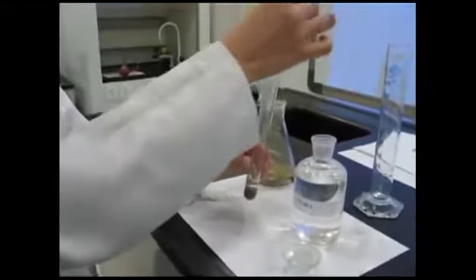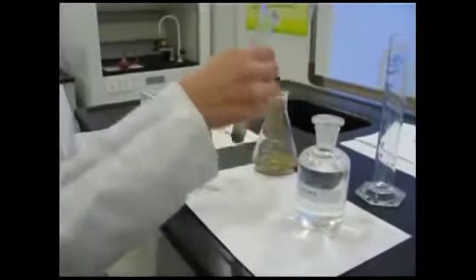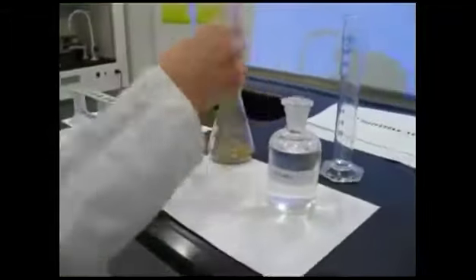Acid extraction. For acid extraction, take 2 ml HCl in the test tube, cover it for 20 minutes and shake well. After 20 minutes, we have to do the filtration. So shaking and dissolving it, keeping it for 20 minutes. Then filter it. It will prepare the acid extract.